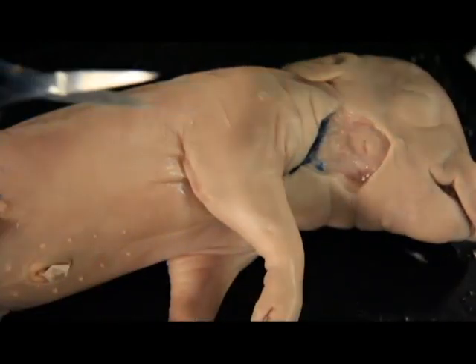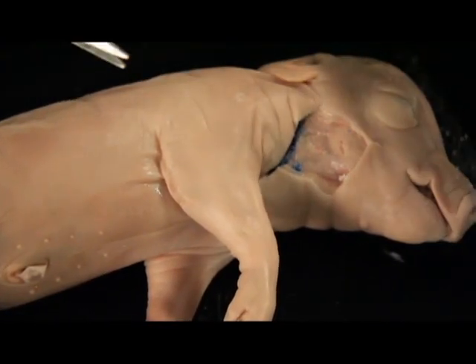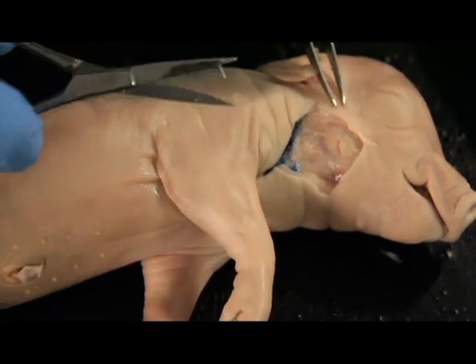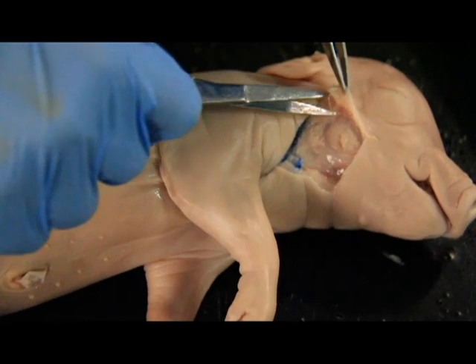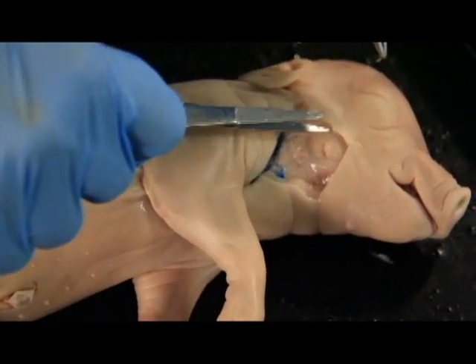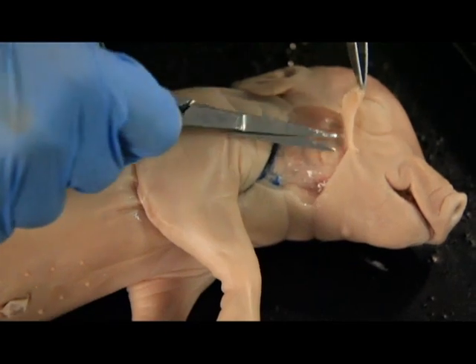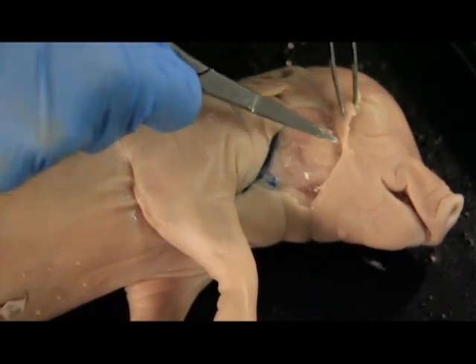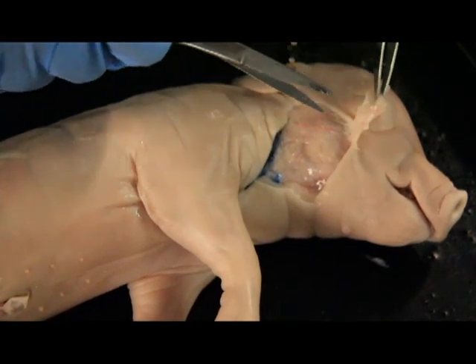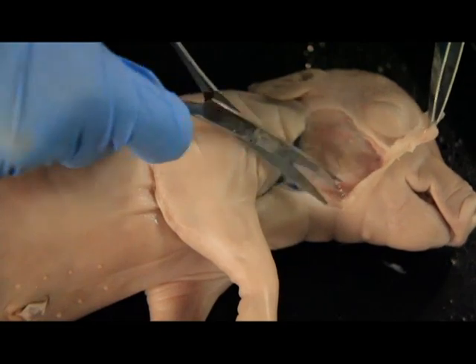So you always want to remember that you want to remove any large pieces of skin. You don't want to leave this so you can't see. You want to remove it so that you can get a nice clean look at your pig. And then again, we want to lift and cut very shallow right at that connective tissue, because we don't want to go too deep. And the first thing that we should see here is this big round cheek muscle. That big round cheek muscle is going to be known as your masseter muscle, and that controls the jaw.